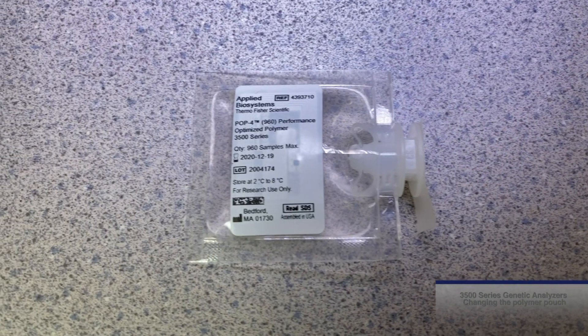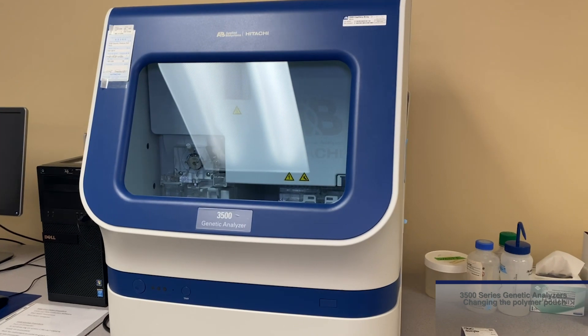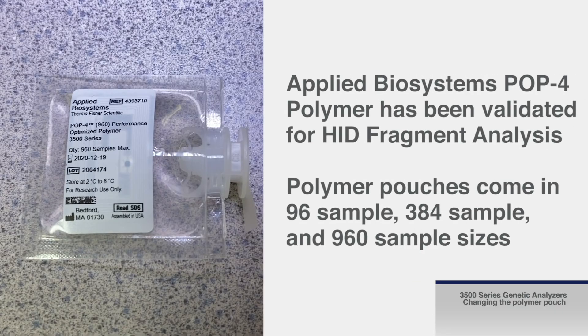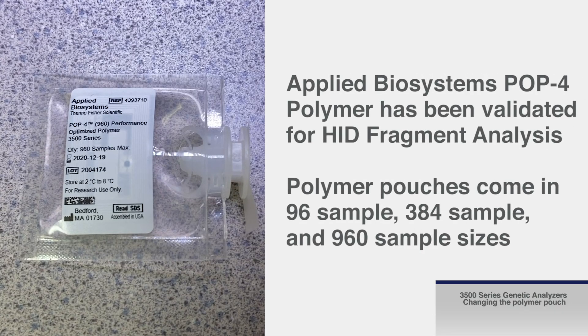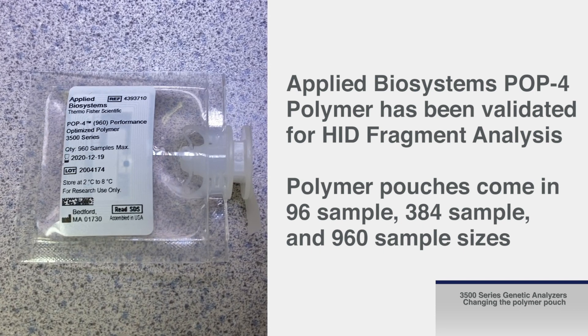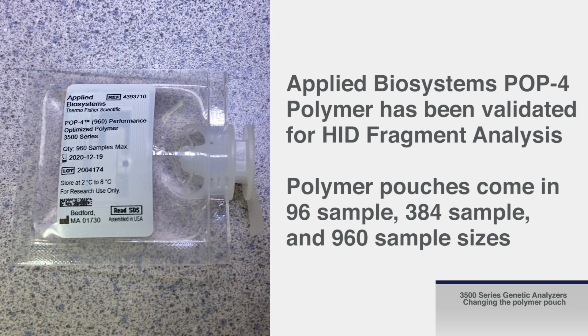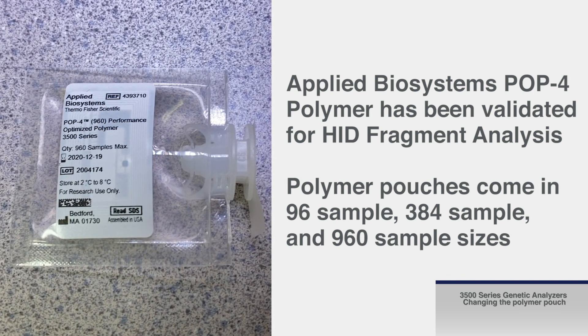Next, we will walk through the steps to change the polymer on your Applied Biosystems 3500 series genetic analyzer. Applied Biosystems POP4 polymer has been validated for HID fragment analysis. Polymer pouches come in 96 sample, 384 sample, and 960 sample sizes.